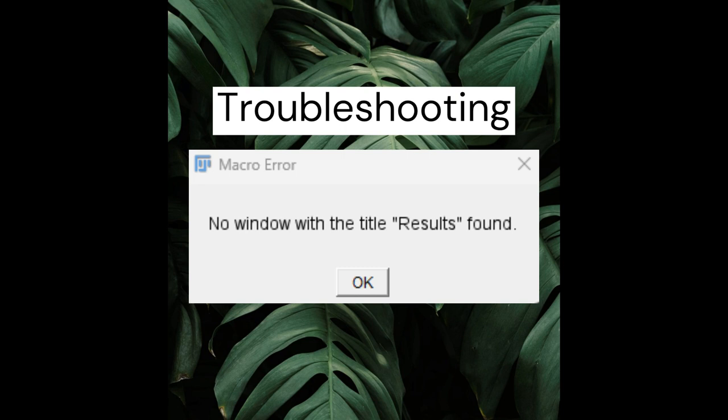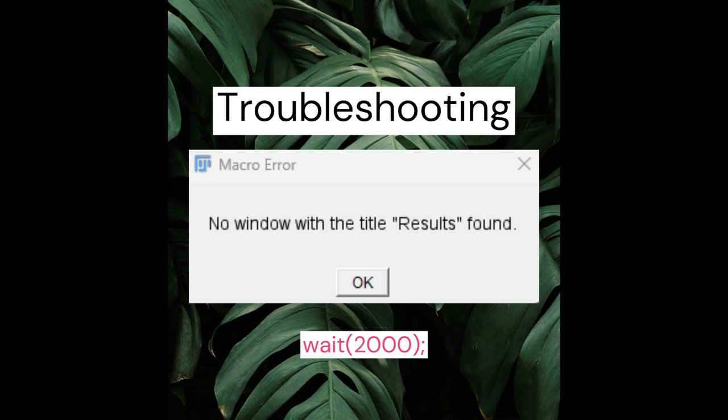Depending on your machine, what I advise you to do is to set the machine performance to low at the beginning and retry. If there is still an issue, look at the detailed macro issue report and find the line of code where the issue occurs. Then hardcode a wait command before that line in your macro, such as wait(x), where x represents milliseconds — for example, 2000 milliseconds.